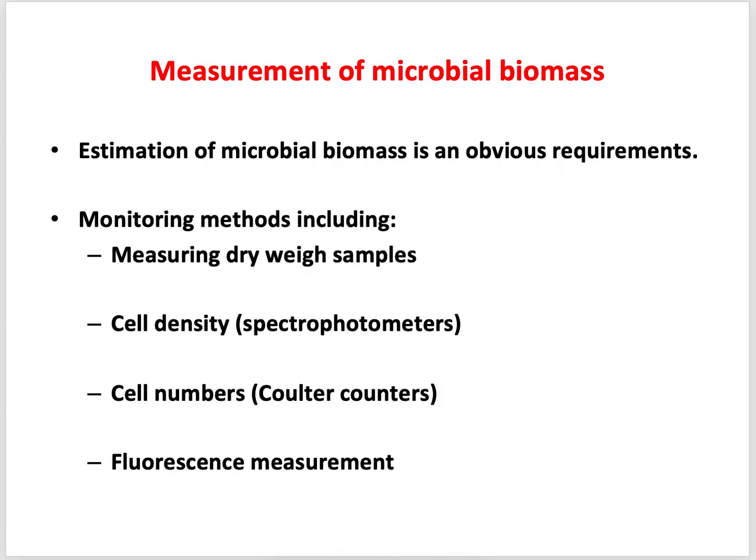Then, measurement of microbial biomass. Estimation of microbial biomass is an obvious requirement, and there are different methods by which it can be monitored. The amount of microbial biomass can be measured and monitored.